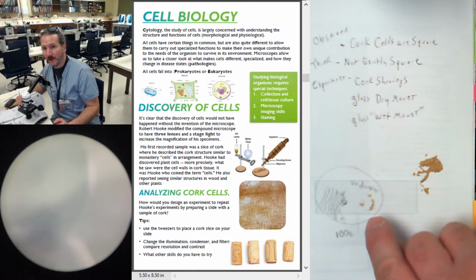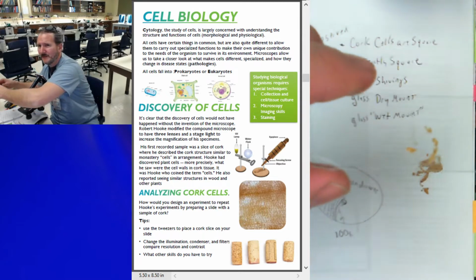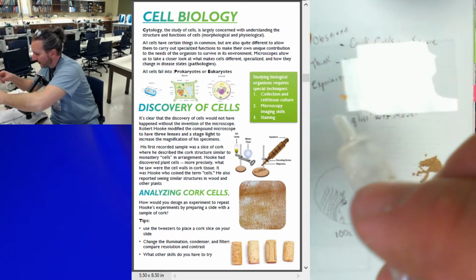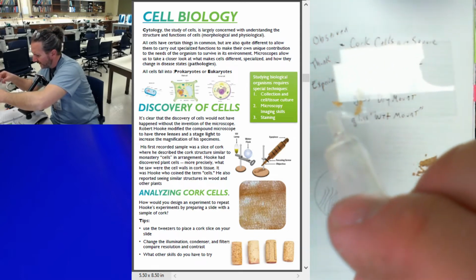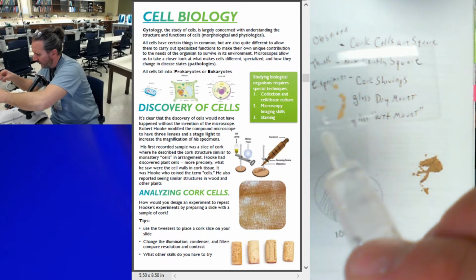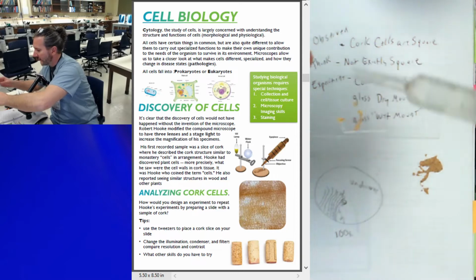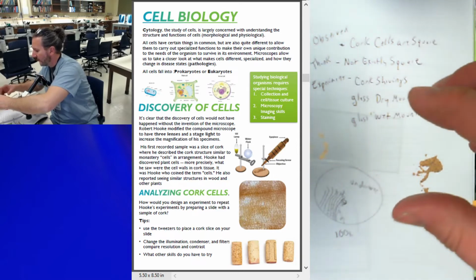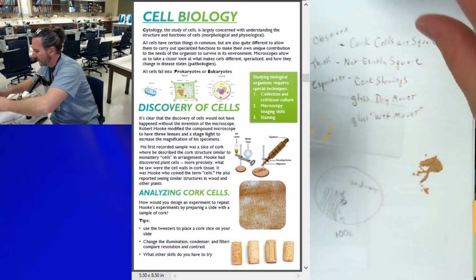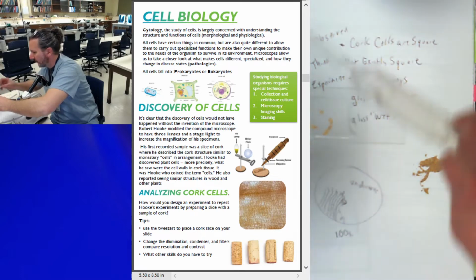Wow, that really filled about all of it. I don't think you can see all that well right now, but there's a little bit of air over here on the side. So what I'm going to do is I'm just going to touch the side of this. A little bit of water. Boom. And I didn't have to put a full drop on there. I just touched the side and it sucked the water right in. Right. I'm going to bring this back. Oops. This piece is all under there. I don't want air bubbles, and I just created another air bubble, so I'll just put a little more water here. There it goes, perfect.